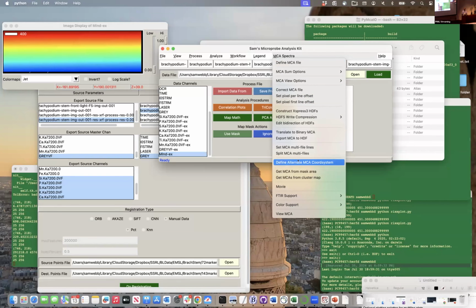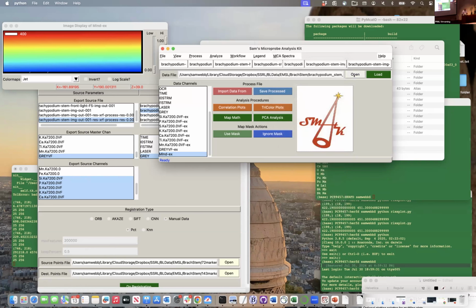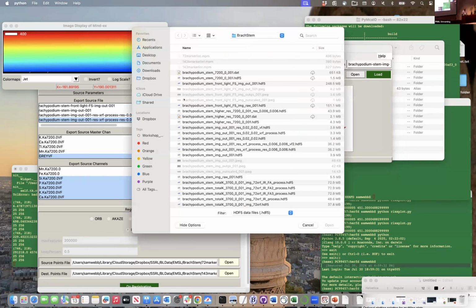I'd point it to that data channel. And now when I say to look at my data at that point, it'll go and use the right coordinate system that's been mapped onto my new sample. And this looks really nice because it's a nice, flat screen. When we do this step with more complex data sets, so if you remember, yesterday we showed this exact same data set, and I showed how nice it finally mapped the infrared data on there.